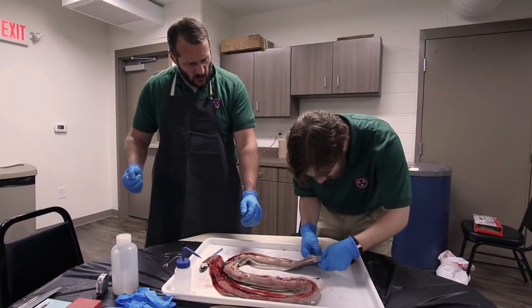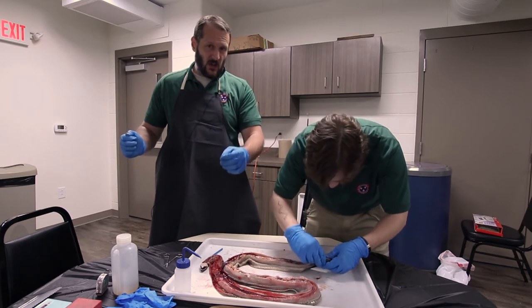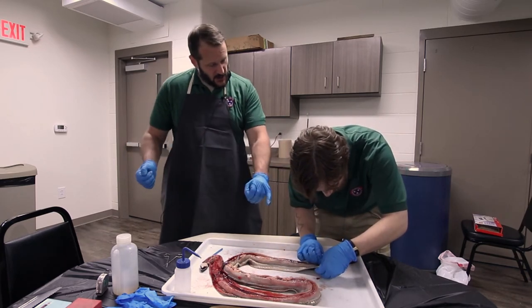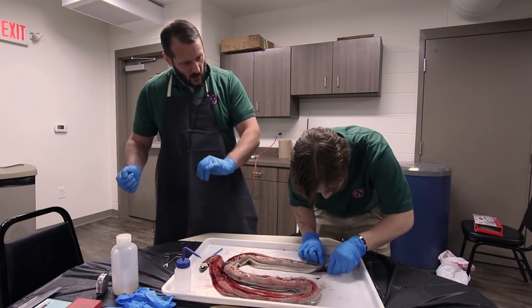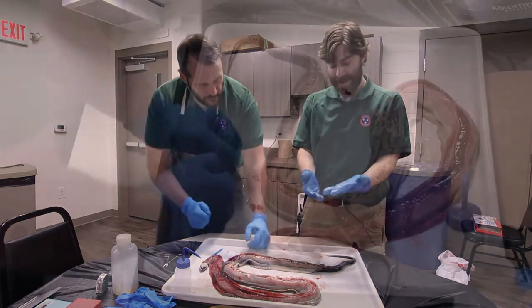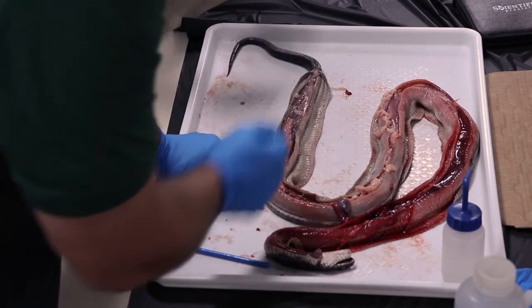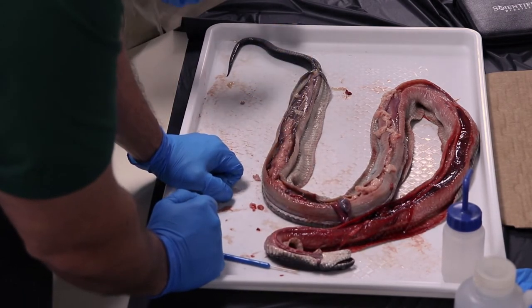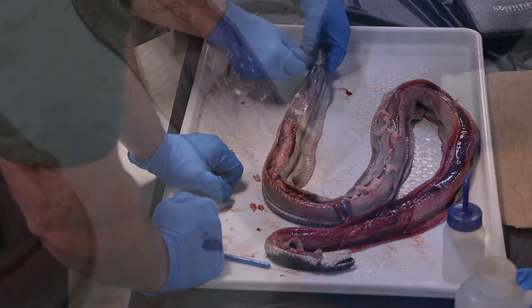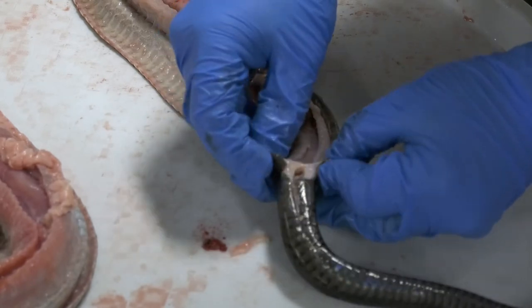So now let's talk more about this cloaca. So the cloaca is a singular point of entry and exit on the underside of the snake. You're telling me that is where waste is excreted, but that's also the reproductive entrance? Yep. So if we were going to be able to tell this was male or female, I'm guessing that somewhere around there is where we would tell, right? A male would have what's called hemipenes. And a female would not.